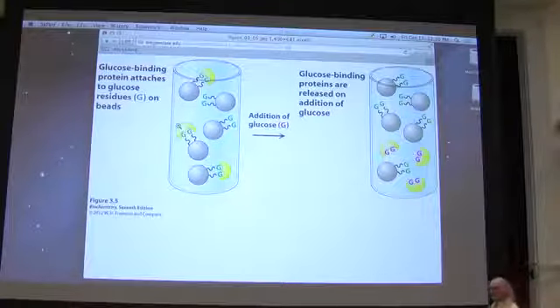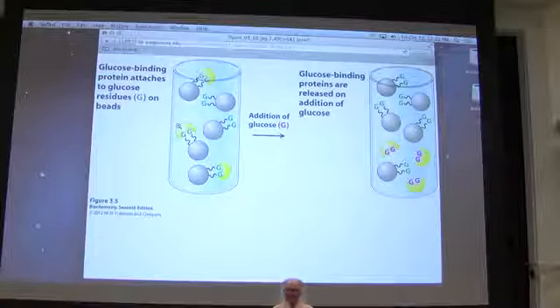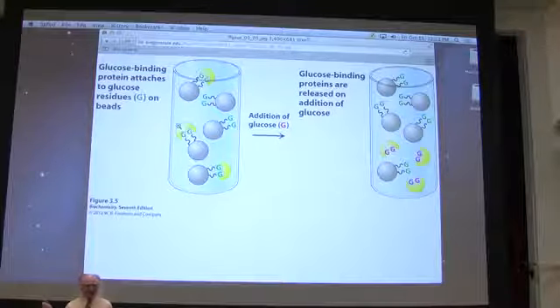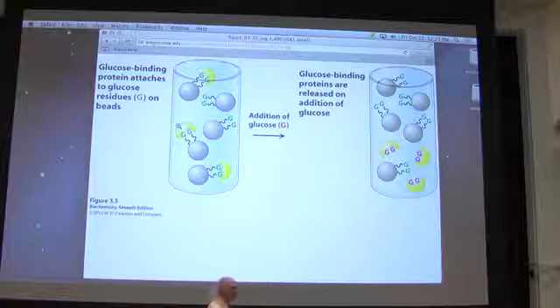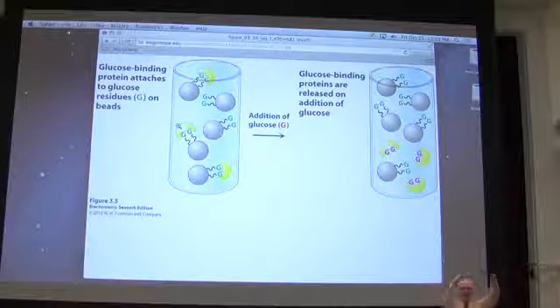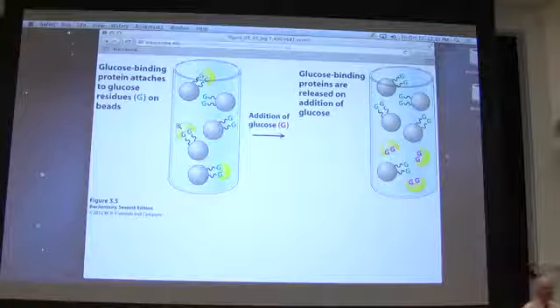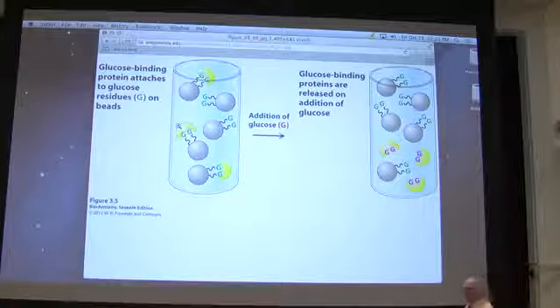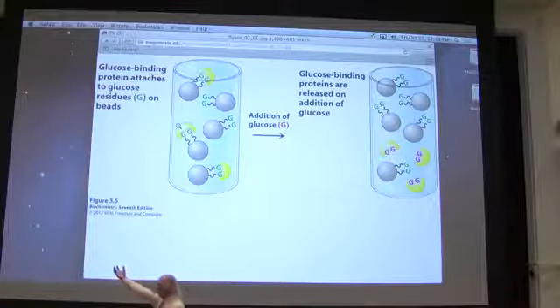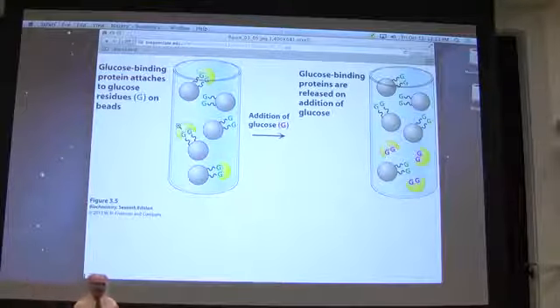So, for example, we're going to talk about proteins later this term that bind to and use ATP. Well, let's imagine for a moment we take those beads that we've been talking about all these times, and instead of attaching something else to them, we attach ATP to them. So we've got a bead that's full of ATPs. And let's imagine that I take my mixture of proteins that I get from the cells, and I pour them on the top of the column, and I let them come out. What's going to come out first? Well, the things that are going to come out first are those proteins that don't bind to ATP. The things that are going to stick to the column, at least at first, are going to be the proteins that bind to ATP, because they're going to bind to the ATP on there. All of a sudden, I've just purified all of the ATP binding proteins in that mixture.